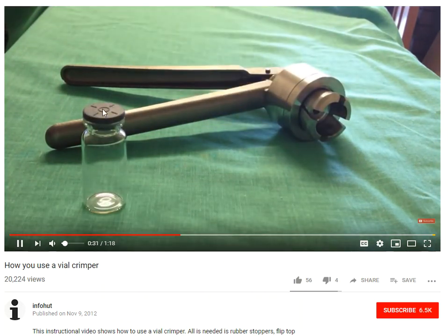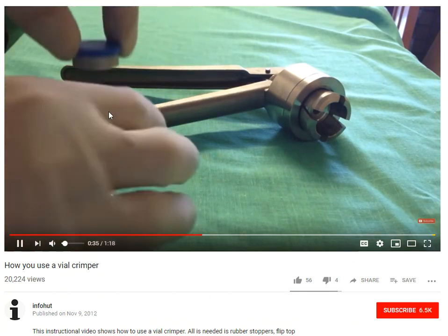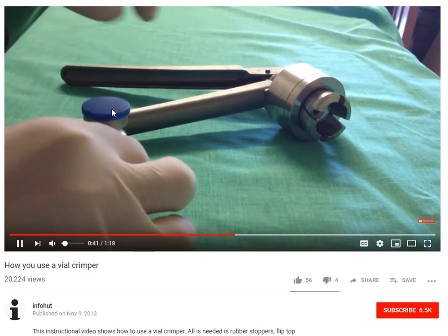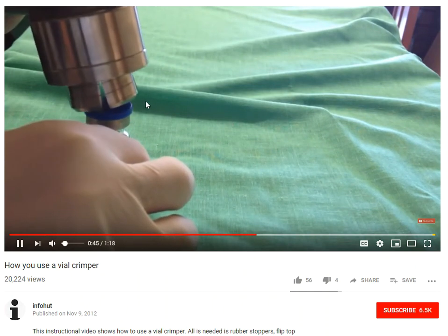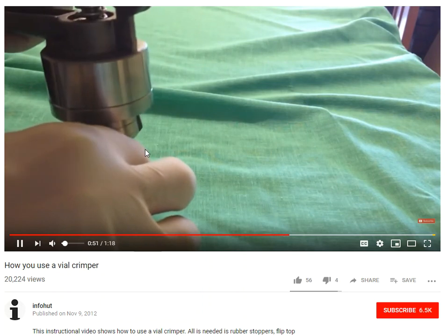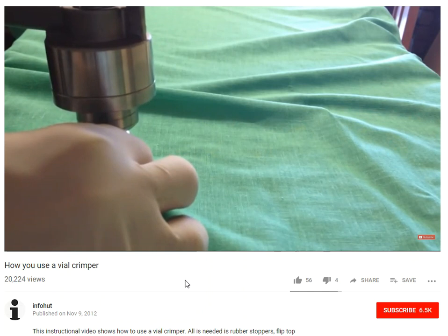We see a piece of rubber stopper that goes into the middle. This is like your septum on a GC system, the same type of material. The lid goes on that piece of rubber. That lid can be punctured by the auto sampler needle, and then the crimper goes on to the top, and you just pull the lever and it crimps the lid in place. It's as easy as that, people. It doesn't really get any more difficult than that.